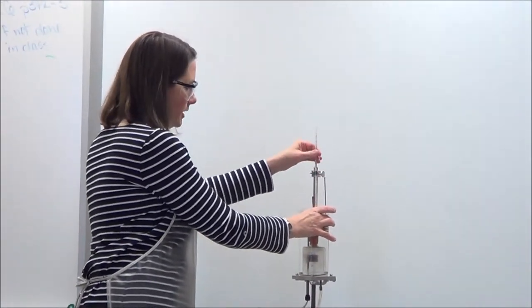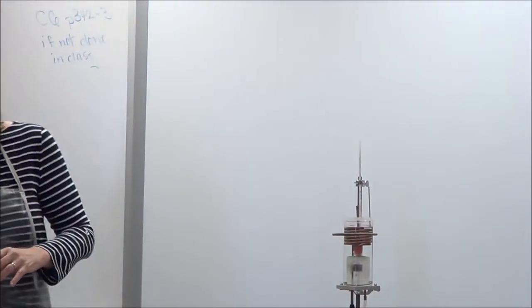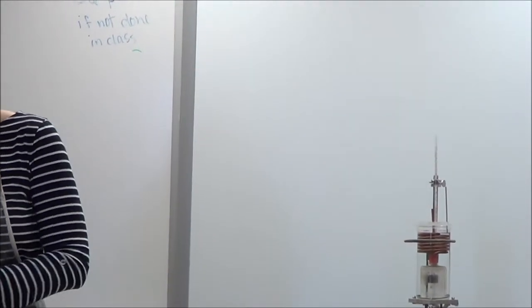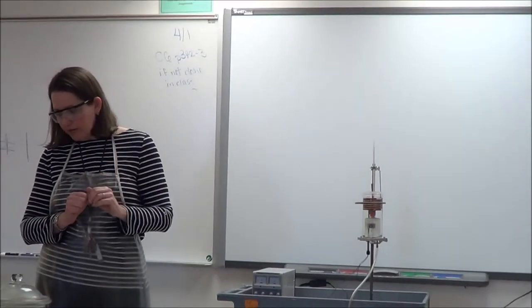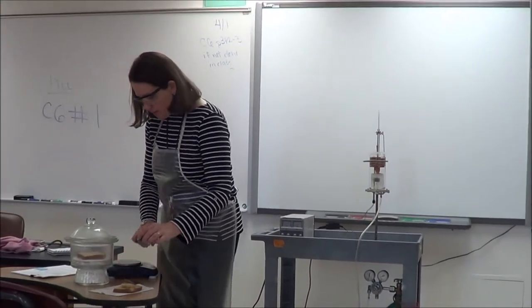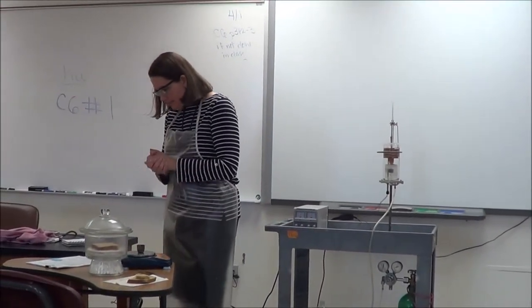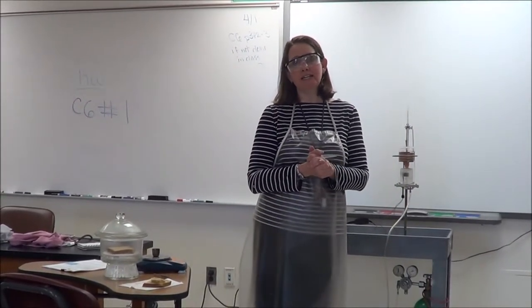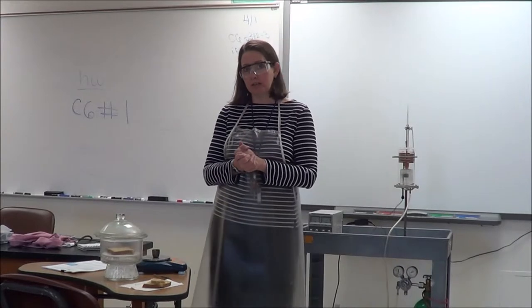This will ultimately be sitting like this on top of the burning piece of bread in the crucible. The amount of water in this calorimeter is listed on your handout. It's 600 grams of water that are currently in this bomb calorimeter. The next thing we need to measure is the mass of the bread and the crucible before combustion. If we put that on a zero balance, we'll see that the mass of that is 13.99 grams. So record that in your data table.